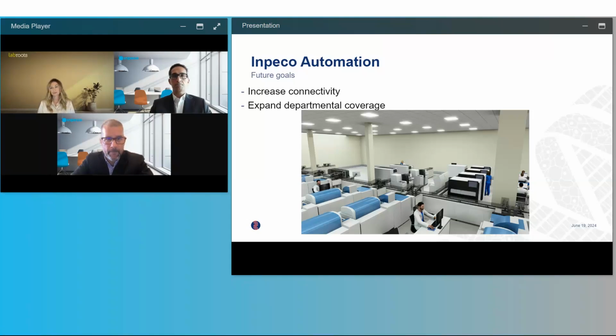For example, in New York State, there are very strict regulations on what non-technical versus licensed technical people can do, whereas in other states, many of those tasks that New York State mandates to technical people can be legitimately done within the CLIA regulations by a non-technical person. So the headcount savings, the actual dollar savings, depending on the type of headcount, and the impact to your laboratory is going to be very specific to your environment. But at a minimum, you should see significant impact.